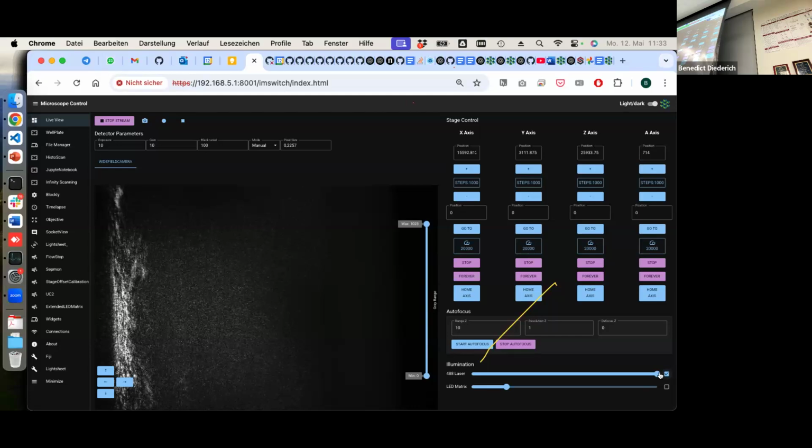Then you see these other way. Okay, so you see, it's actually not quite dark and white, and it's quite okay, but it's rings that we see there. And the reason why we see rings is it's actually not a plain wave that is coming out of the system, because I intentionally kind of detune it.